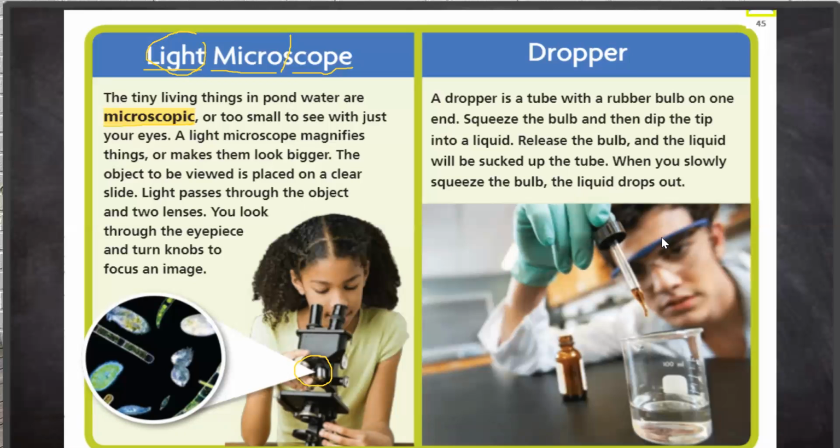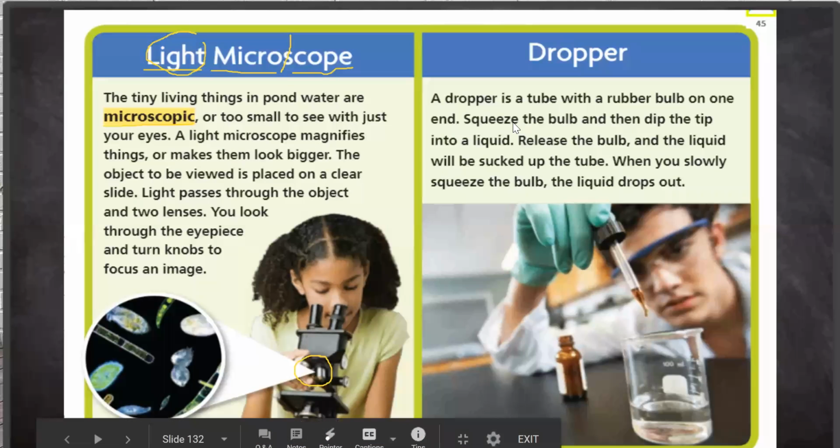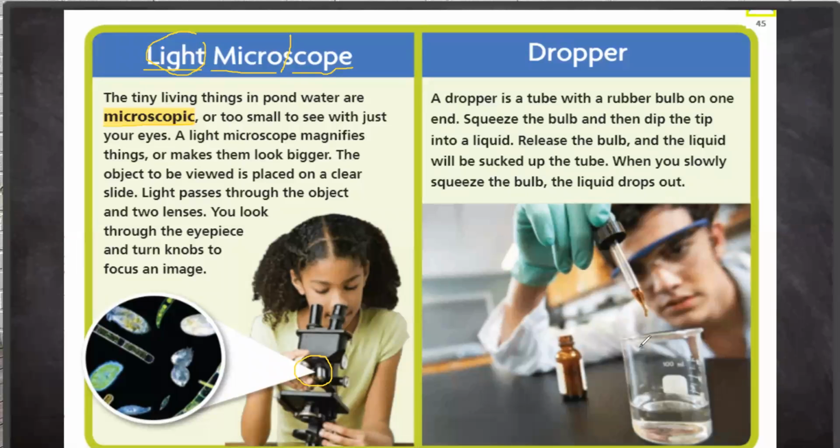No, it is not accurate. It only can give you one drop, two drops, but sometimes it can slip and give you 3 drops or 2 drops together. Is that right? Yes.